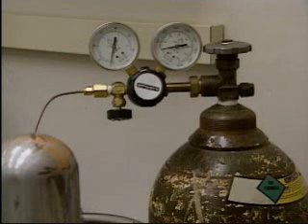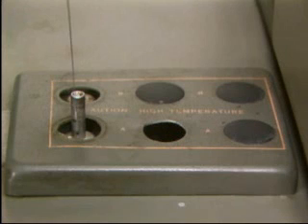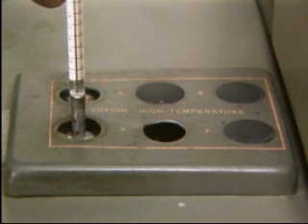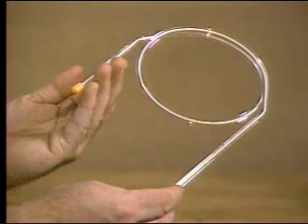A tank of helium is the carrier gas supply. The helium is fed in at the back of the gas chromatograph. This is the injection port, where the sample is injected into the gas chromatograph. The column filled with packing material and the thermal conductivity cell are located inside, but this is what a typical column filled with silica gel looks like.